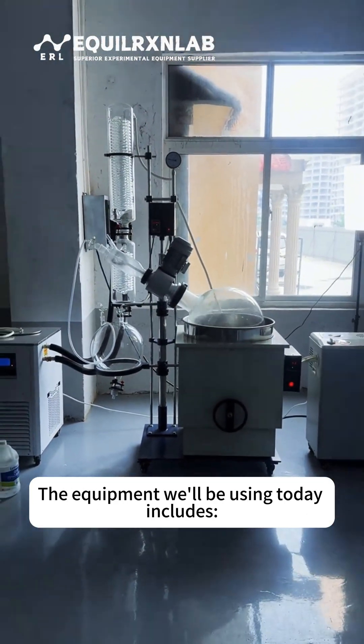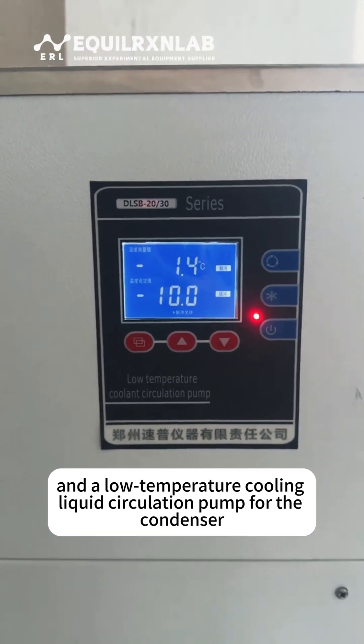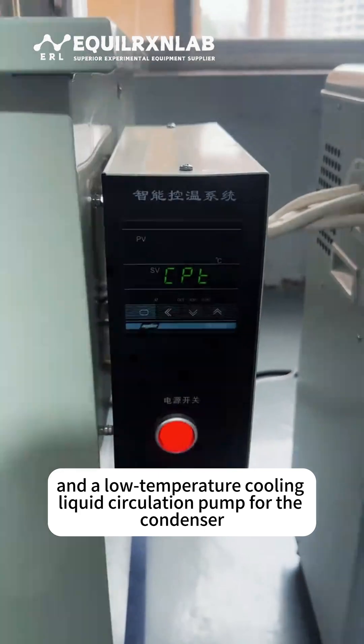The equipment we'll be using today includes a 50-liter rotary evaporator, a circulating water vacuum pump, and a low-temperature cooling liquid circulation pump for the condenser.